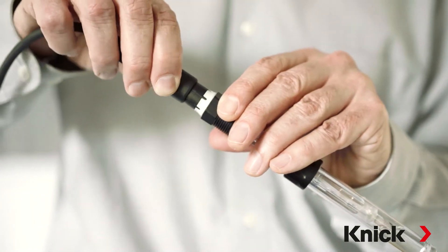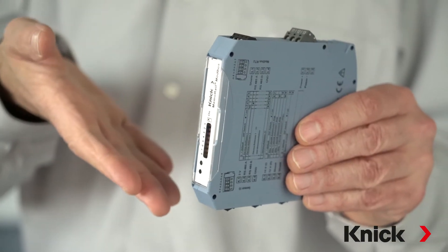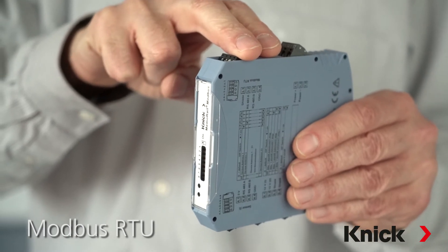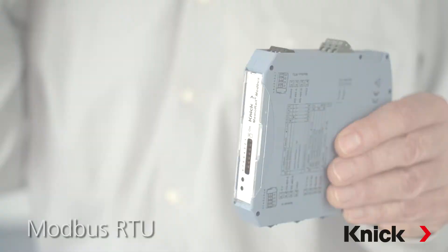We're talking about the proven MemoRail Compact Transmitters for measuring pH, ORP, conductivity, and oxygen with MemoSense Sensors. But what's new? The new MemoRail Compact Transmitters are equipped with Modbus RTU – an open fieldbus standard with good data throughput.